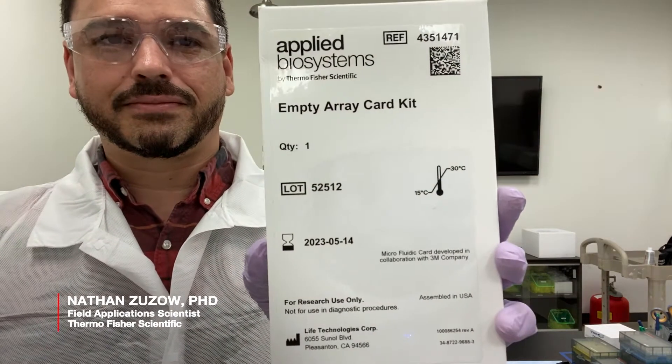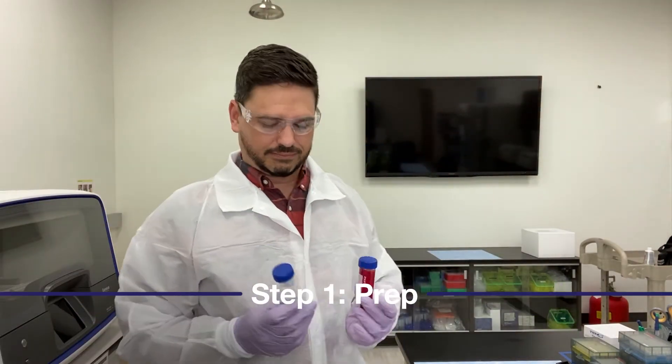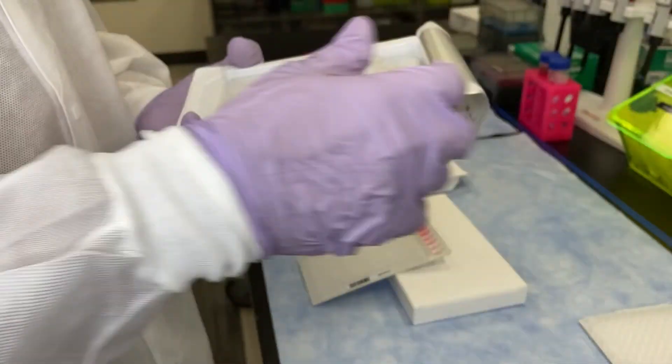TaqMan Array cards are easy to use and quick to set up. Prep your PCR reaction mix by combining the master mix with your sample, then remove the card from its packaging.